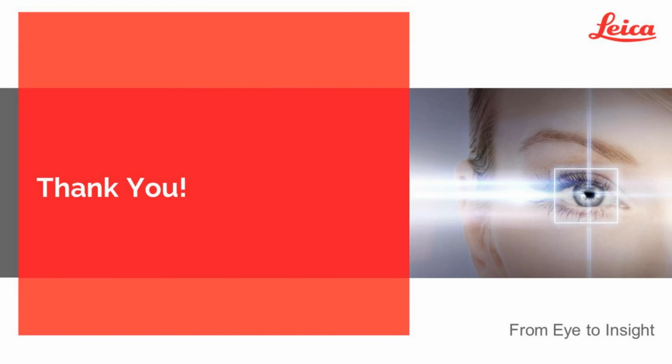And then in deep learning, rather than the human providing any information about what they're looking for, you just provide the raw data and the ground truth, in the sense of what we are doing with imaging. The software will attempt to find an answer and correlate them, and it uses a significantly deeper network. It also generates a lot more parameters than is humanly possible, and that allows us to create a rule that is more robust compared to machine learning.